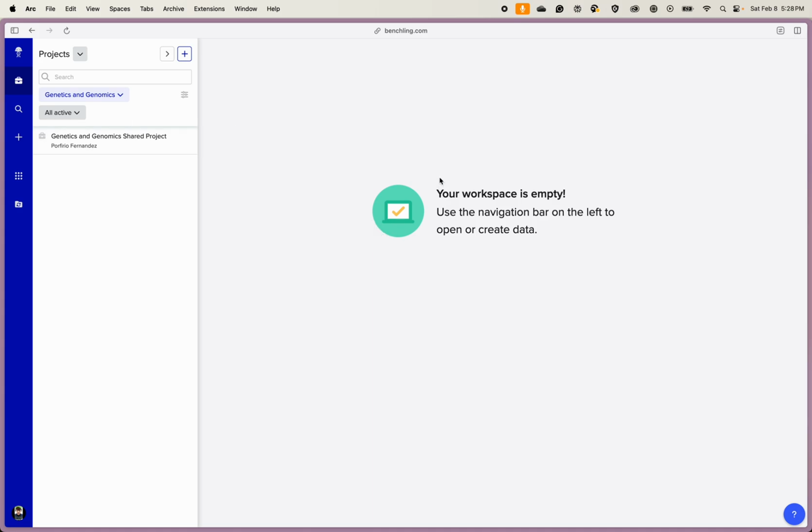here called Benchling. Now, Benchling is an online lab notebook, and many lab spaces in academia and also in industry use this lab notebook to keep track of all their work. And it also has a slew of cool molecular tools and things you can use if you're doing genomic work. So I'm going to go over with you guys an alternative.